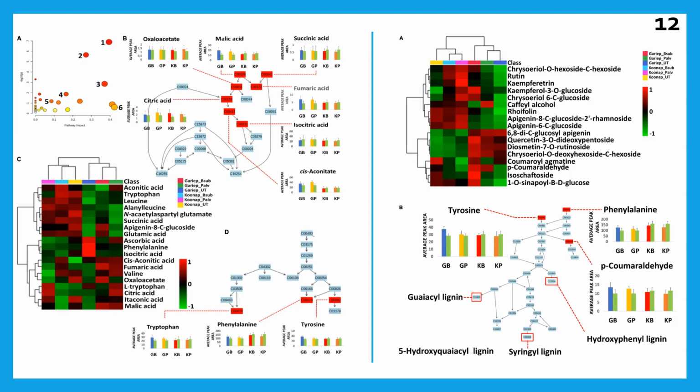Right. So the alteration in the secondary metabolism of the PGPR-treated cultivars could serve as a primary mechanism in plants to deploy a more robust, stronger, and lasting defense response upon pathogen recognition. So this is compared to untreated plants. So the observed metabolic configuration could also be a gateway to PGPR-mediated induced systemic resistance.